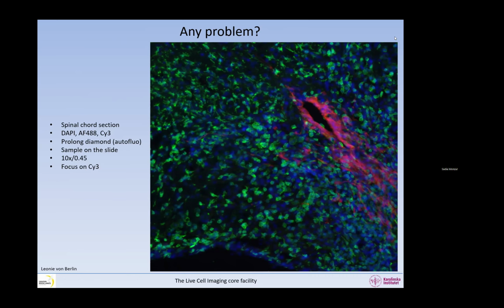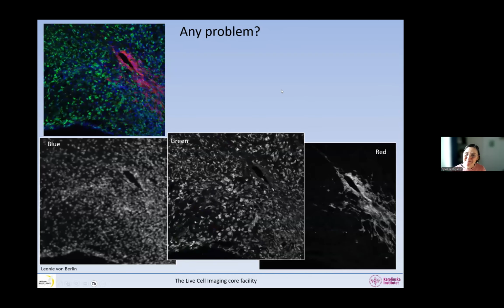It doesn't seem to be focused. What is not focused? Like different parts, the image is not in the same plane. So that was a very good spot. Nobody ever finds it, so I'm very impressed. But look at this one.